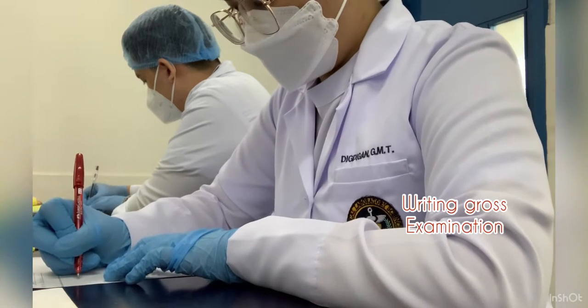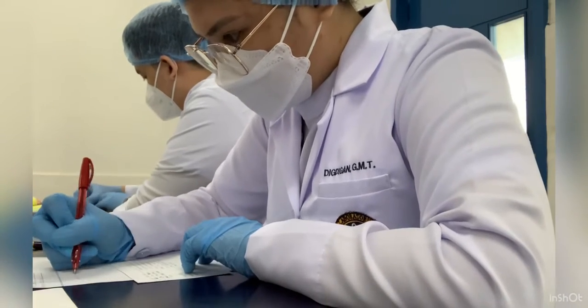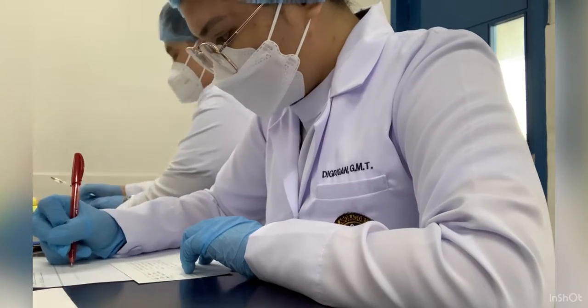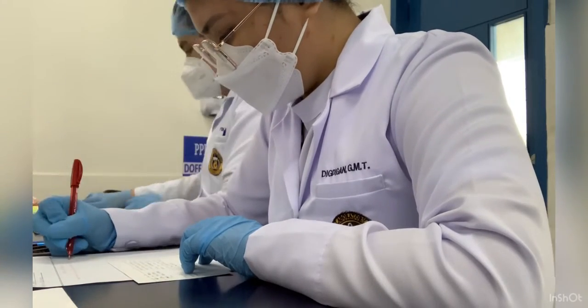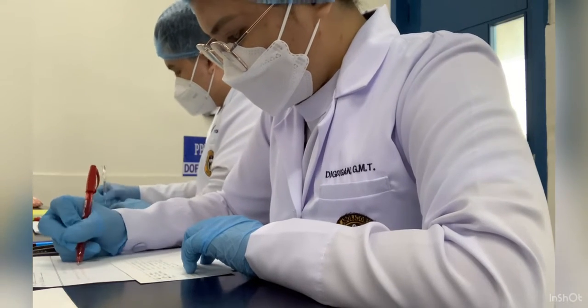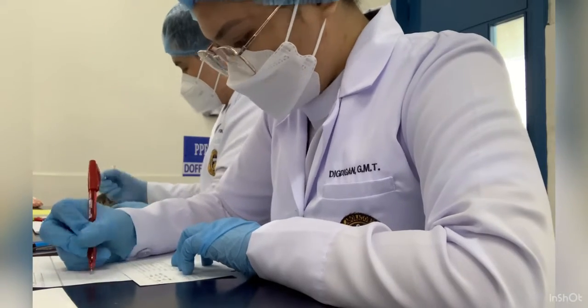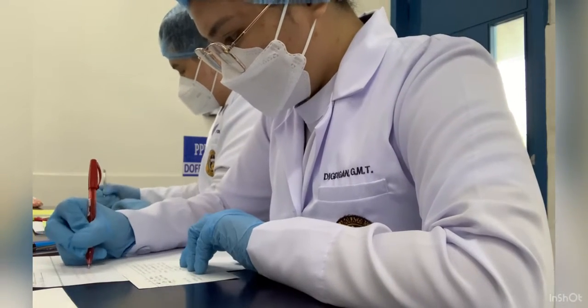Next is writing the gross examination. The final gross examination is: the specimen consists of 3 pieces of creamy white, rubbery texture, irregular shaped pieces of tissues, each measuring 2.9 cm, 3 cm, and 9 cm.